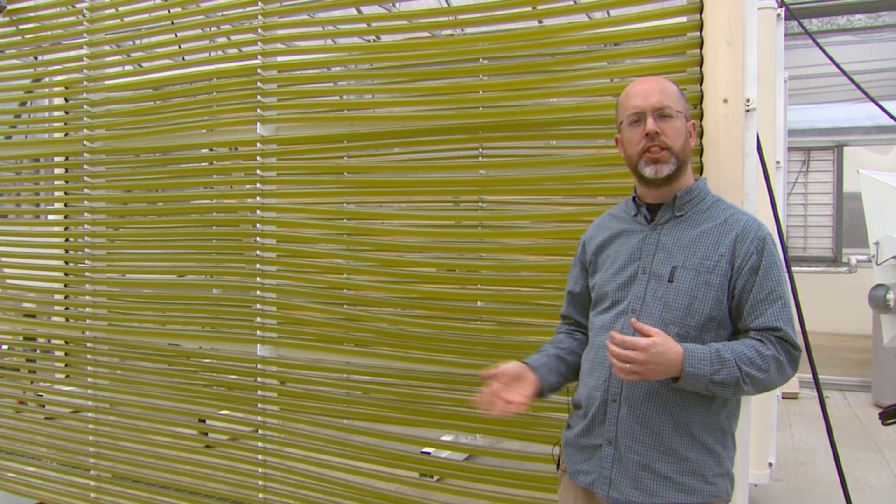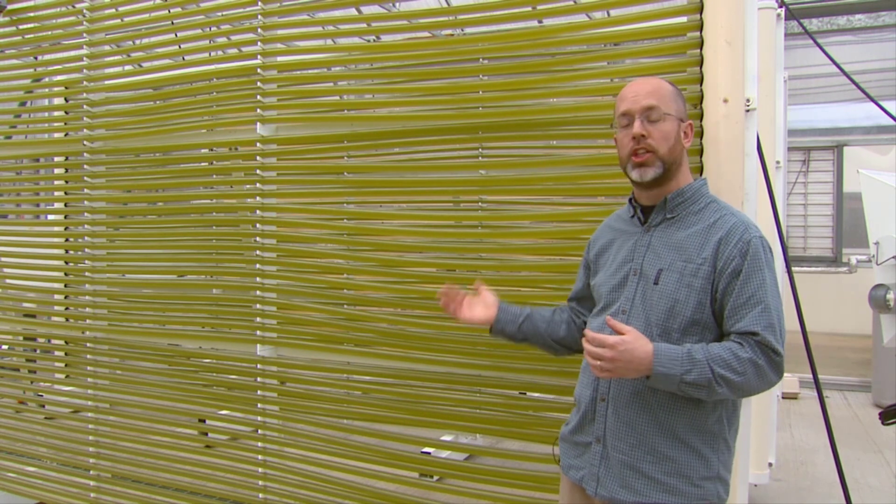The other systems we talked about — the flask cultures and the carboy cultures — are batch harvests. Once it grows up and is dense enough to harvest, you have to harvest the whole system and start all over again: tear it down, sterilize it, re-inoculate it, and wait for it to grow. This just keeps going continuously. In some cases we've had these going for an entire year with a species, just harvesting over time. You can also harvest very large volumes at a time. So if you have that need for large amounts of algae to feed mussels, large culture systems like this might be something to think about.